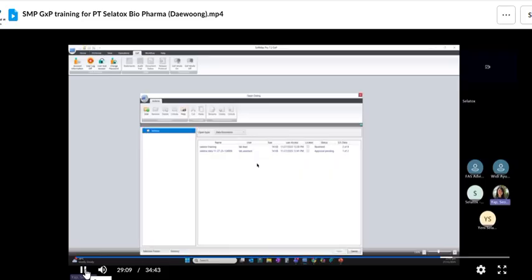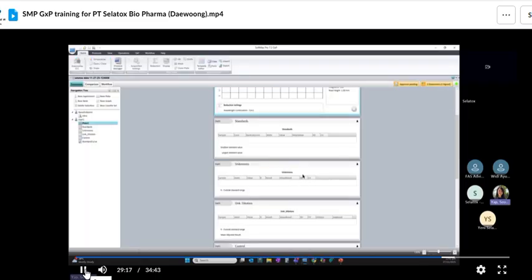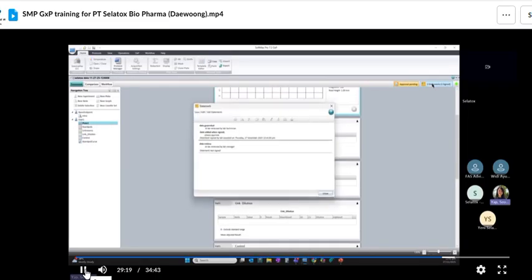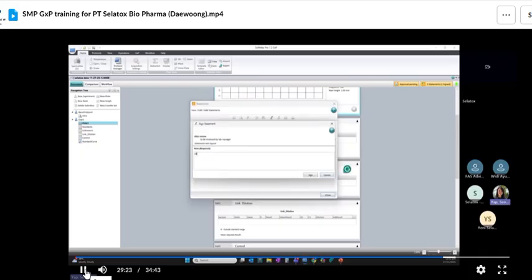Okay, then I go to this folder. You see, this is the file I need to approve. All right. Then I check the result. Once I'm happy as a lab manager, then I will sign this off. You can say approve or whichever comment is needed. Okay, and sign off.